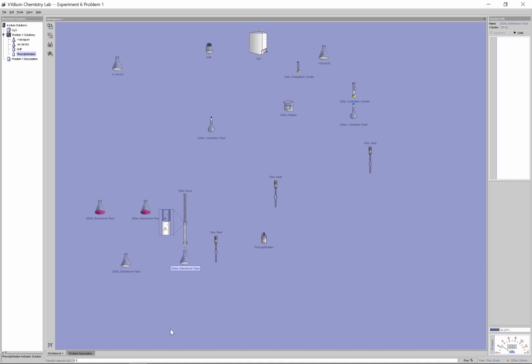Let's drop it in. Let's say 0.5. So 8.5, 9, maybe 9.5, still nothing. I should be getting pretty close here. So let's drop it in 0.1. So 9.6, 9.7, 9.8, 9.9, 10, 10.1, 10.2, 10.3. Oh, there we go. That one I'd still say slightly overshot here, but it's a good approximation.